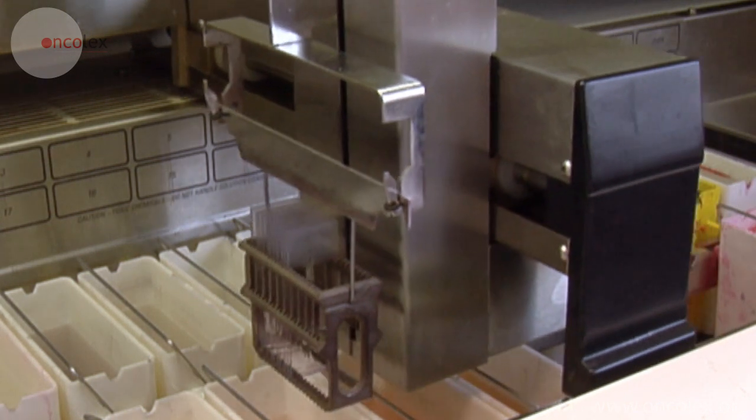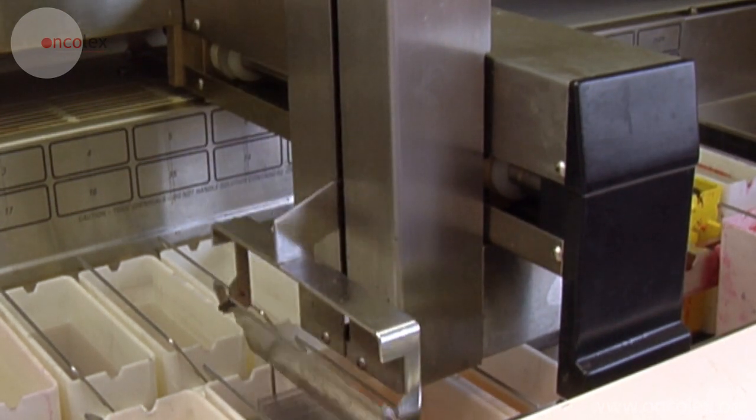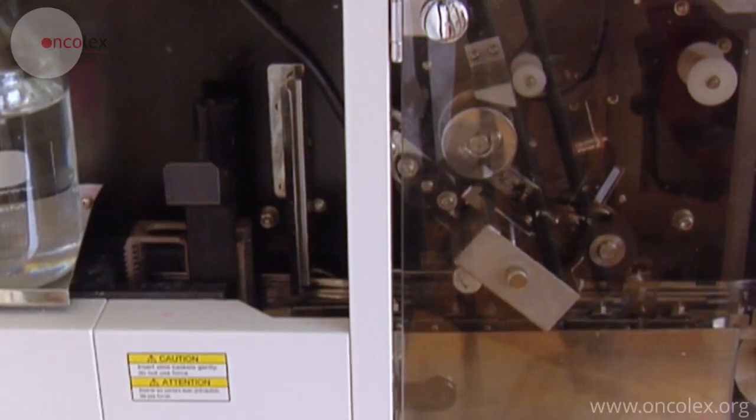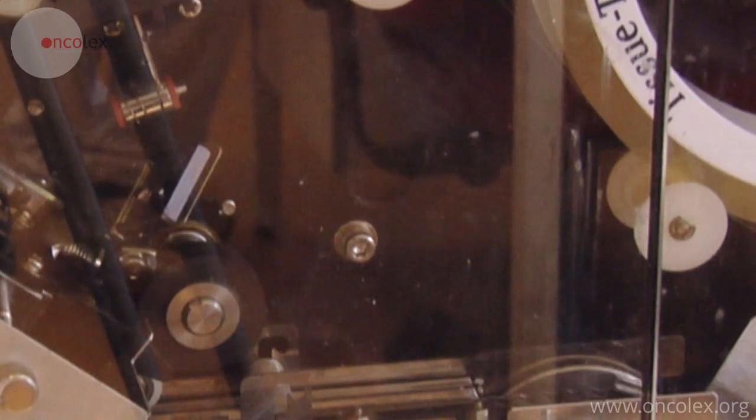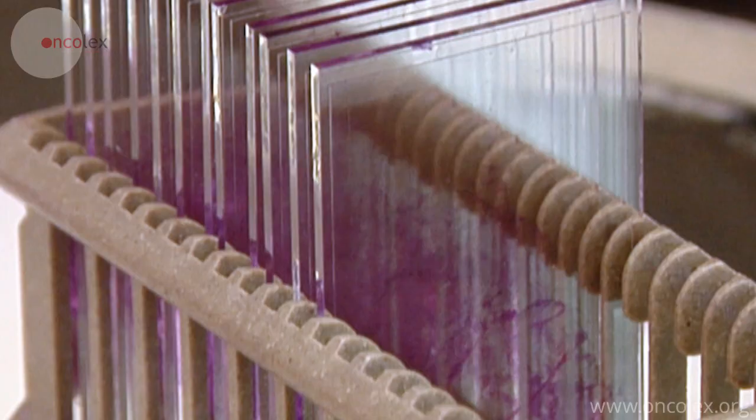The sections are rehydrated and H&E stained in a staining machine. They are then dehydrated and mounted with cover glasses. The sections are now prepared and the pathologist can establish the microdiagnosis.